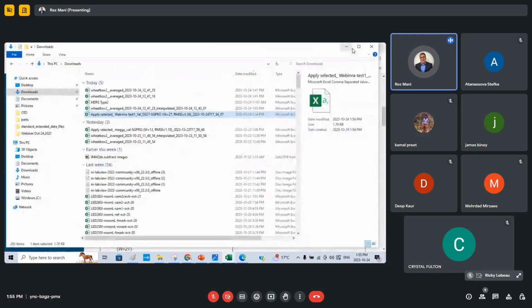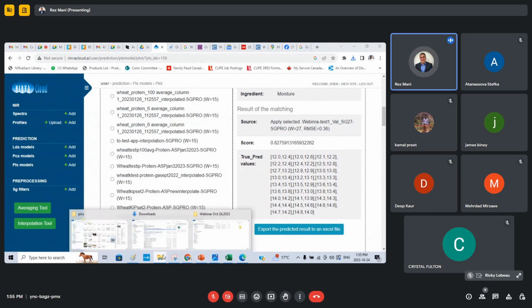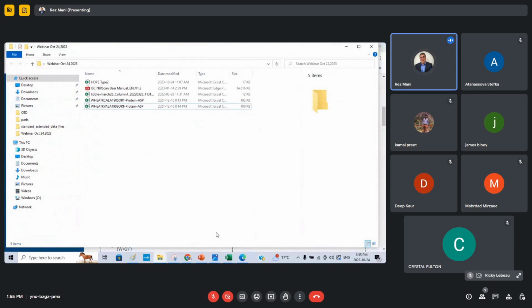You also talk a little bit about PCA modeling or LDA modeling for sorting, for example. One thing that is important in case of the PCA or LDA modeling is that, let's say you are doing plastics, you want to do a PCA model of plastics, you have to make different files for each type.